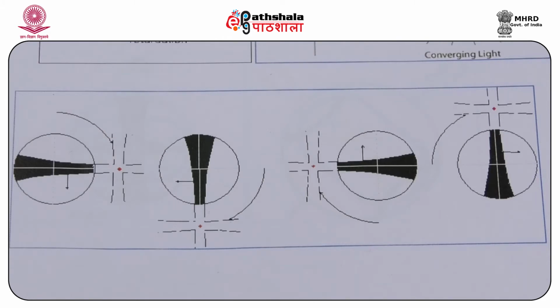The isogyres still form a north-south, east-west dark cross centered on the melatope that swings in an arc around the field of view as the stage is rotated, and can still be used to determine the optical character and the optic sign of the mineral.